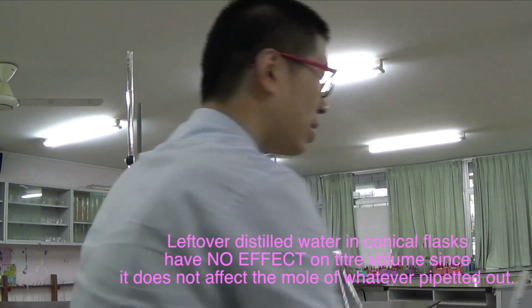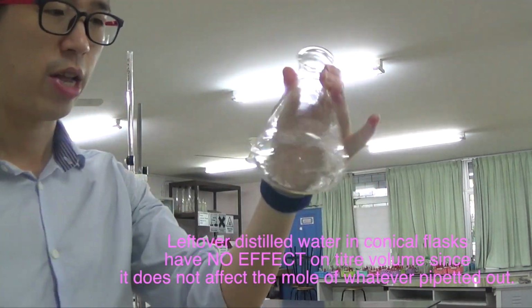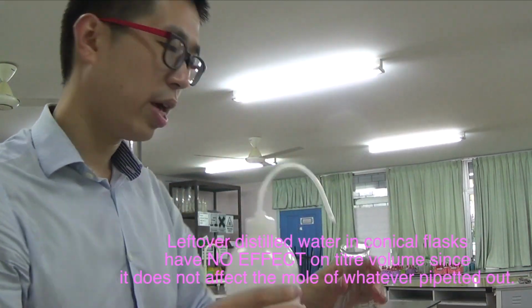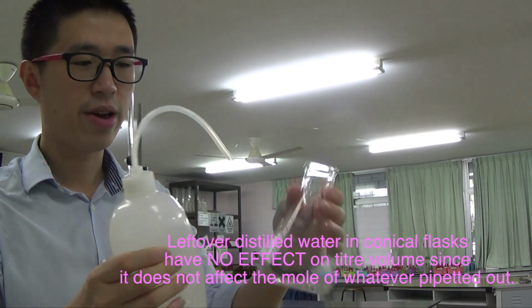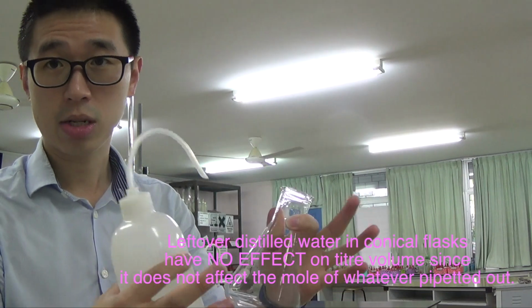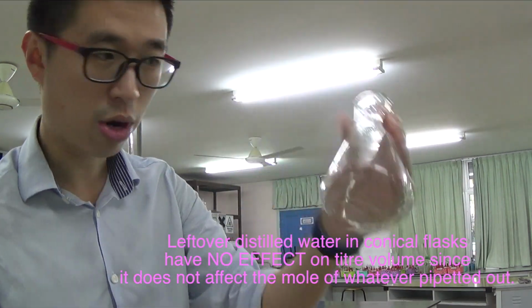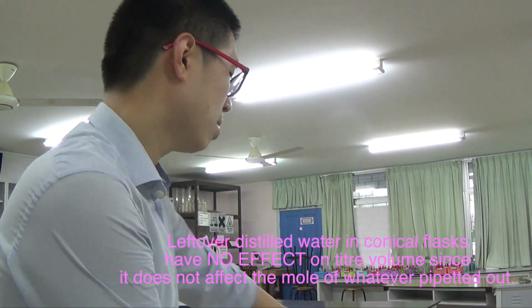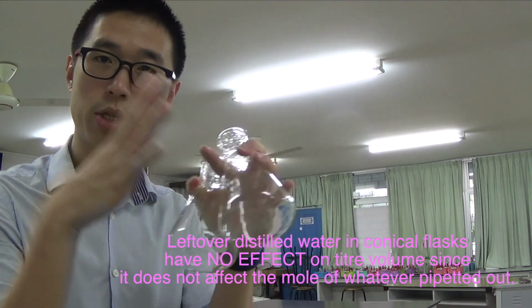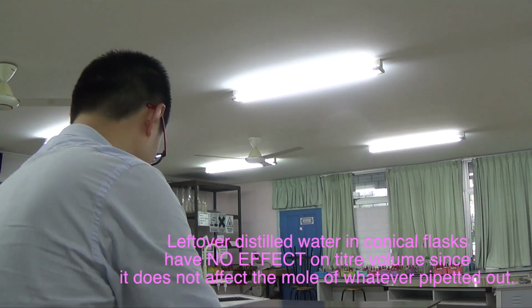I have my conical flask, so I just need to rinse it with a little bit of distilled water. By right, you can wash it with tap water and then just rinse it with distilled water. It's entirely okay to have water left over in the conical flask because whatever you pipette out is going to be an exact amount that goes into the conical flask. So it doesn't matter if your conical flask is not dry or has some water in it, because it will not affect the moles of what you pipette into the conical flask, and therefore it should not affect what you have from your burette titer.